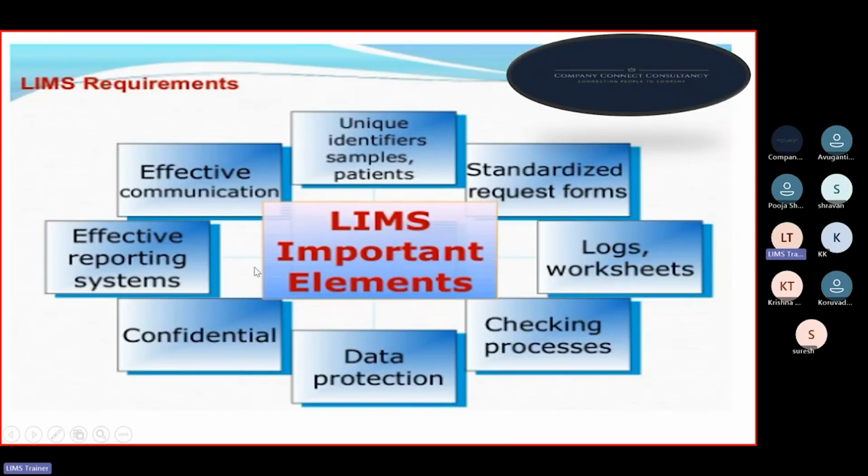There are some requirements for the LIMS. If you can see: unique identifier, samples, patients, standardized request forms, logs, worksheet, checking processes, data protection, confidentiality, effective reporting system, and effective communication. Okay, so these are some important elements.